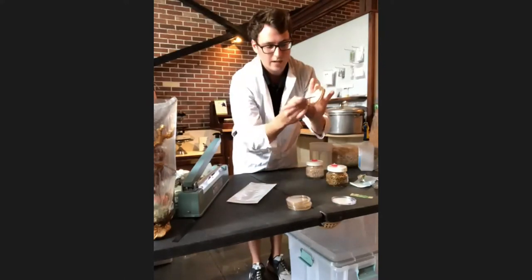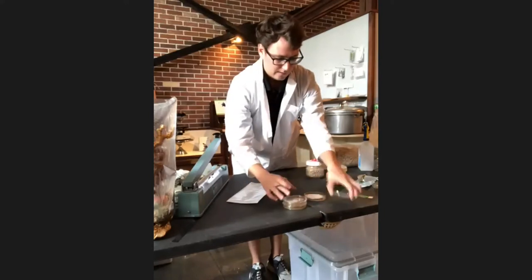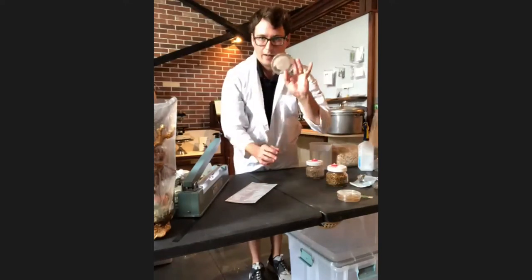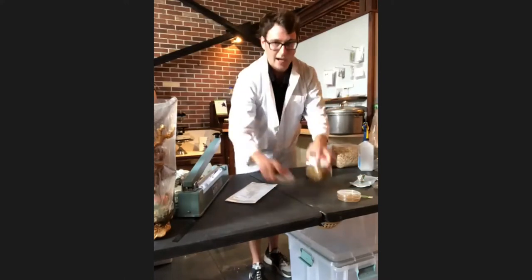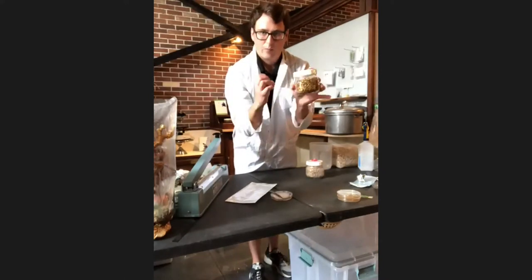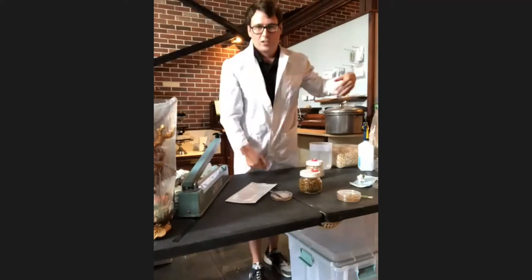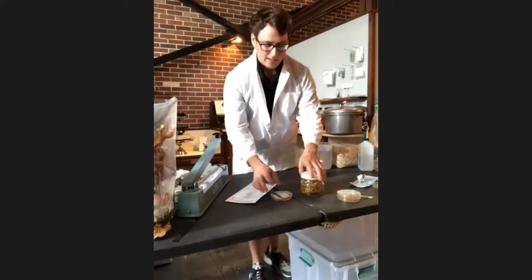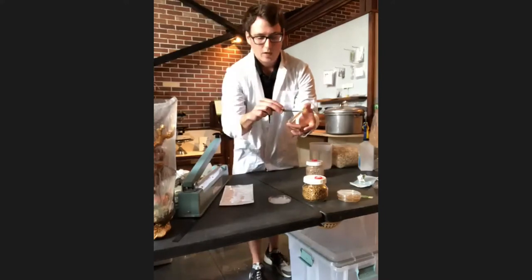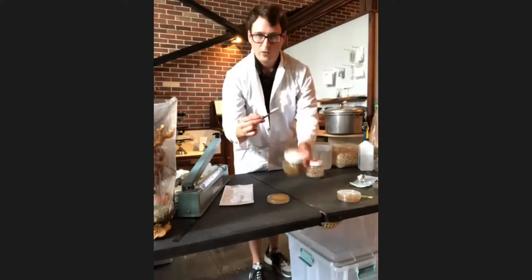I'll make two copies as backups for my original culture. Ideally you want to do enough transfers to maintain a sterile culture. Then these go into the incubator. The next part of production is an agar-to-grain transfer. The mycelium will consume grain, which is a really dense source of nutrients. I like to use oats, but you can use various grains — they have a lot of selection of rye berries here at Lion's Mane that work just as well.